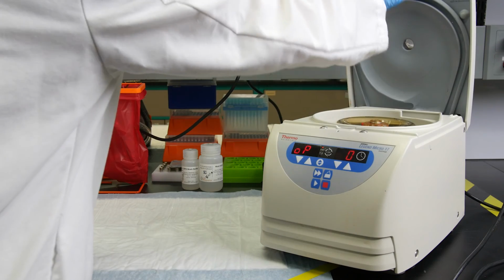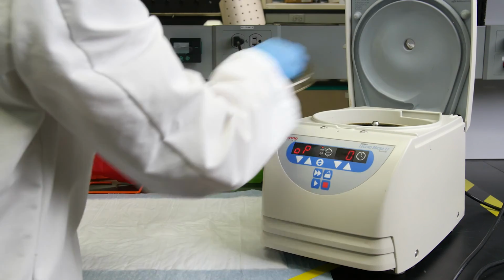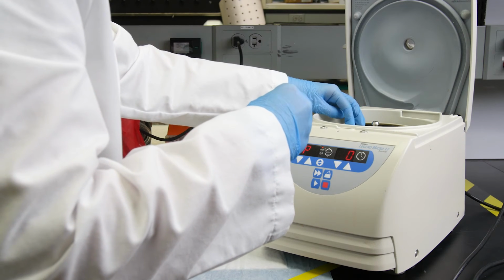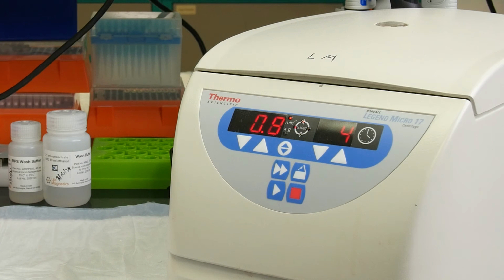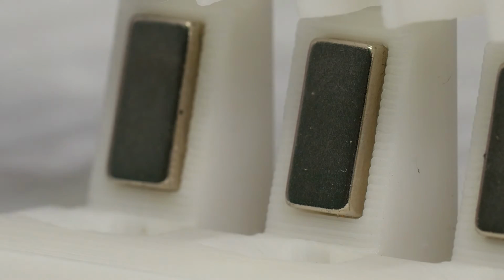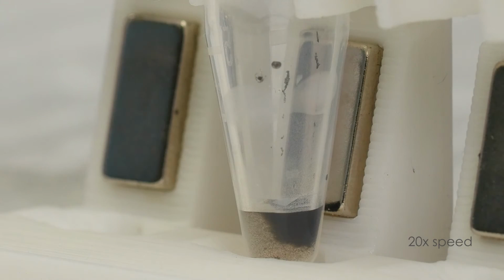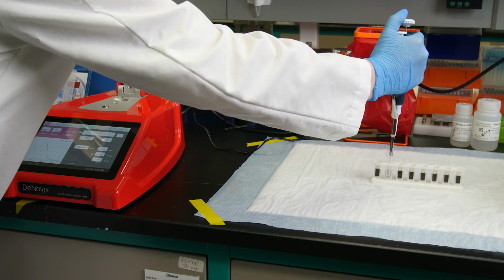After release, separate out the magnetic particles by centrifuge or by using the magnetic stand. If using a centrifuge, run the centrifuge at 10,000 RPM for 1 minute. If using a magnetic stand, keep it on the stand for 5 to 8 minutes, or until the beads are separated, and collect the final eluate.